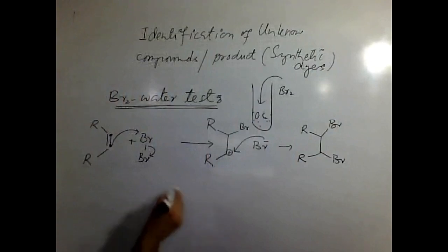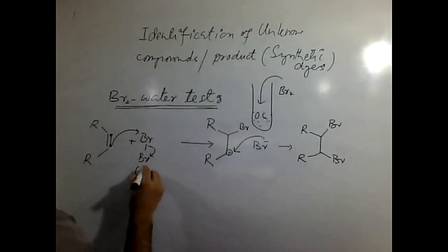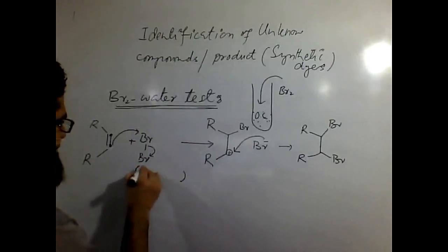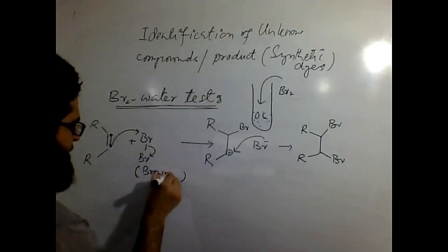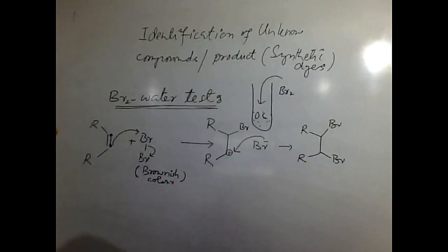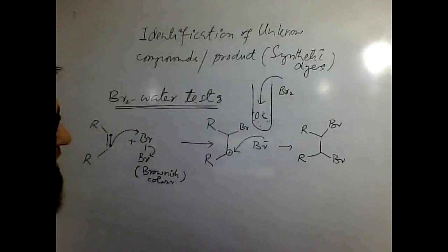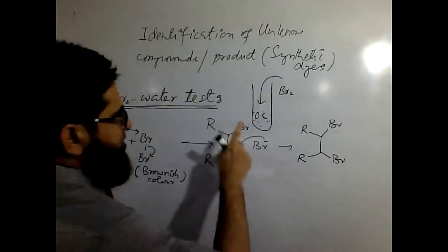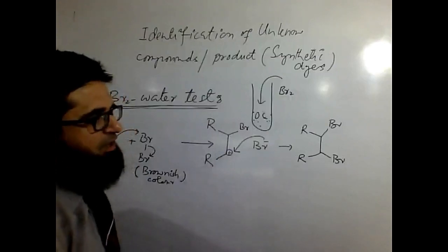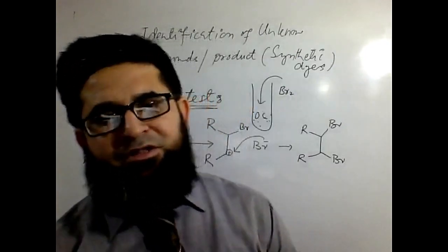Bromine Br2 has an original brownish color of the bromine water. When it reacts, the breakage of the bond between the Br atoms and subsequent bond formation with the alkene results in the disappearance of the color of the bromine water, because there is no more bromine available in the test tube.